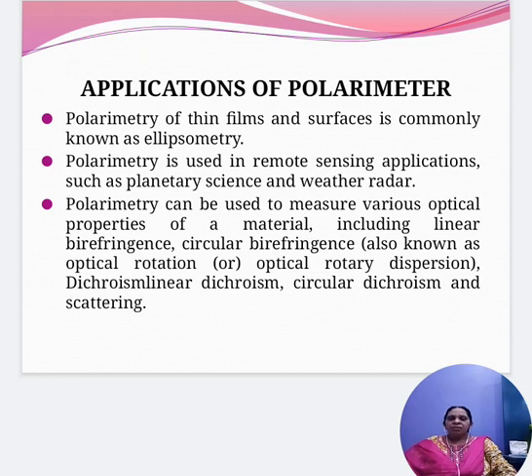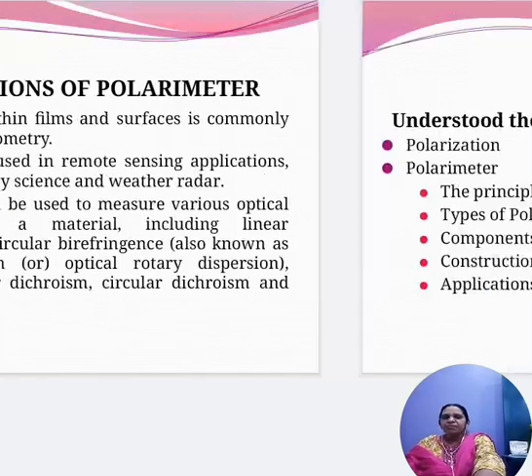Also dichroism, linear dichroism, circular dichroism, and scattering. These are the different applications of polarimeters. Polarimeters are used in measuring the optical properties of various materials.